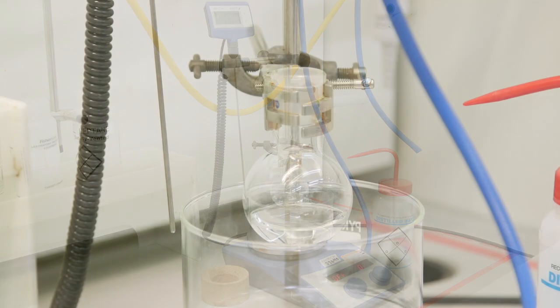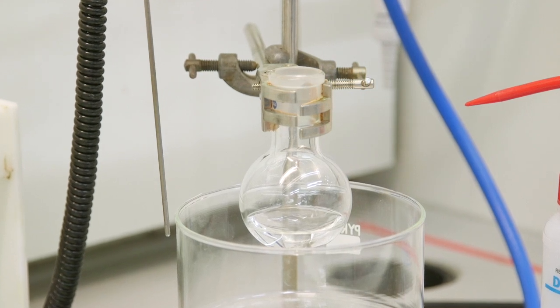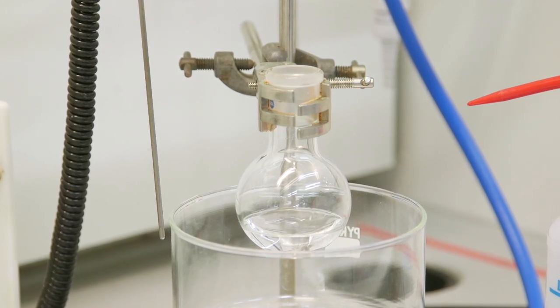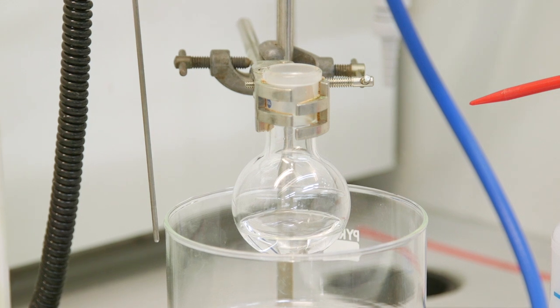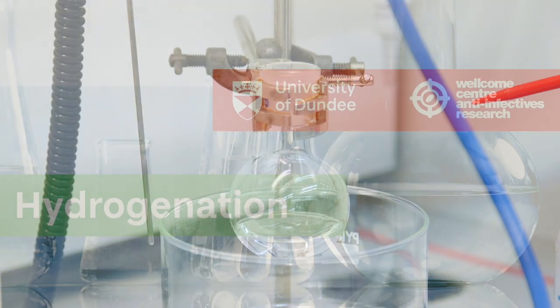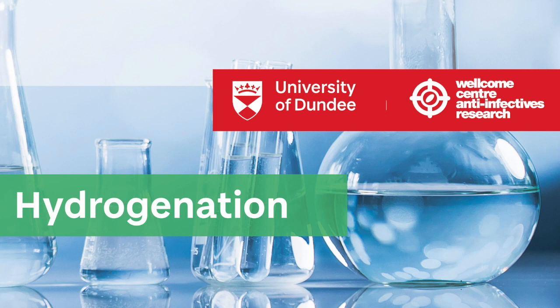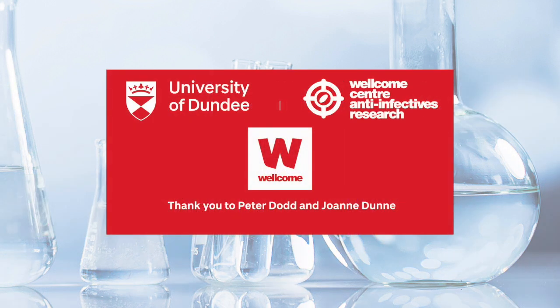You can now evaporate the solvent from the round-bottom flask to obtain your product. In this short video, we have covered how to set up and carry out the hydrogenation reaction using a hydrogen balloon. Added to that, we have also gone through the procedures on how to work up the reaction and dispose of the palladium catalyst.